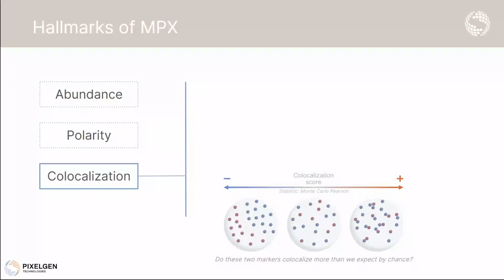They're segregating. If the colocalization is centered around 0, it means that it is random. Whereas if it's positive, it means that these two proteins tend to end up closer to each other more than what you expect by random chance. And then the higher the colocalization, the more colocalized they are. So it's also an absolute metric in that way.